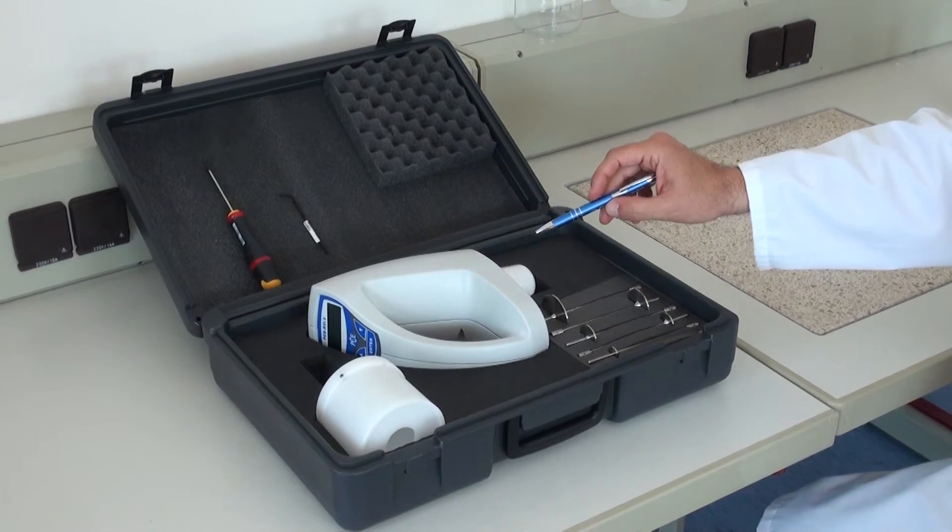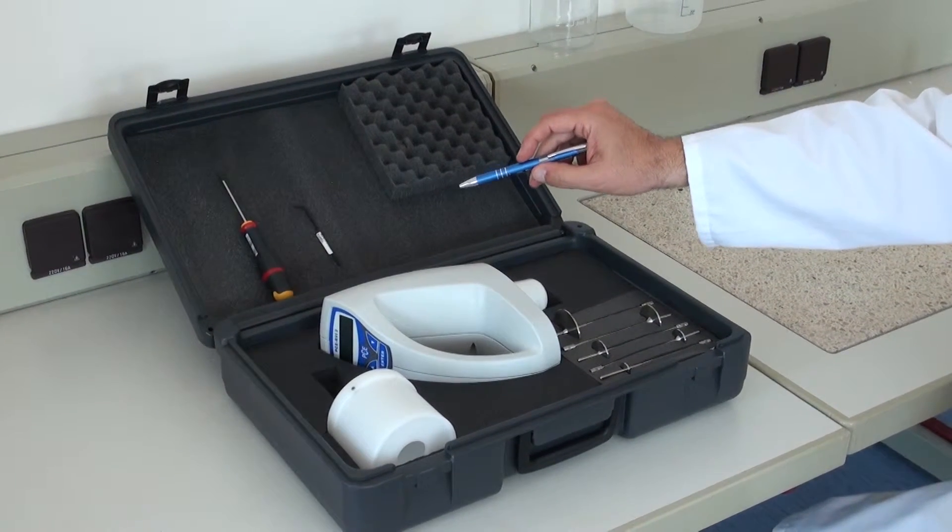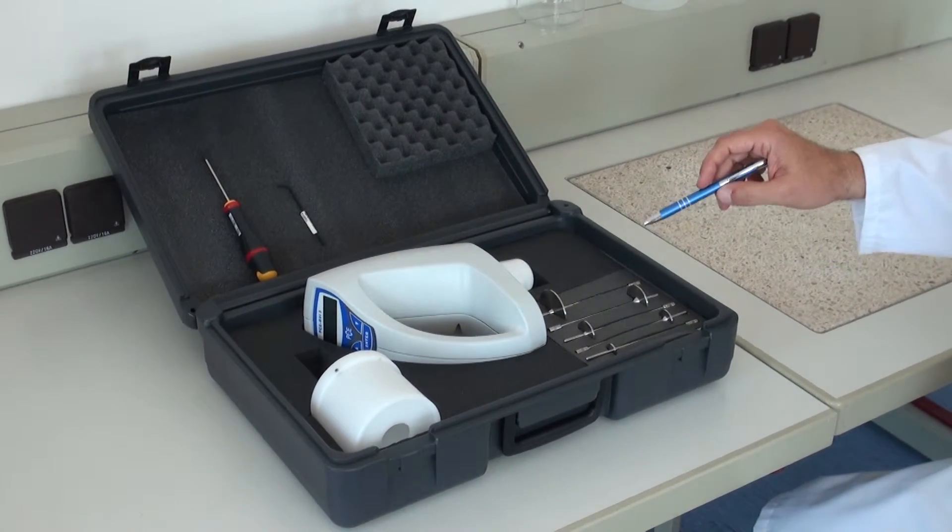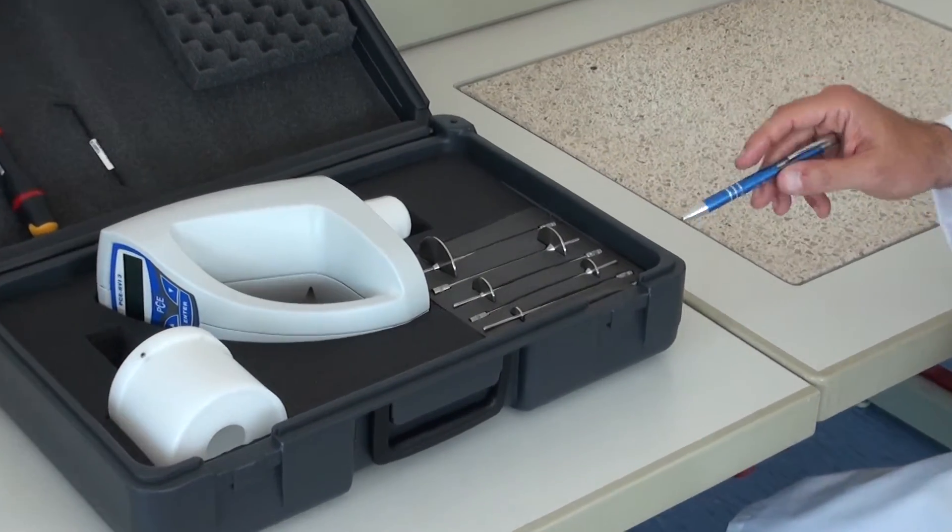four alkaline batteries, installation material, a screwdriver and the Allen key, as well as a protection for the rotation bodies and a set of rotation bodies.